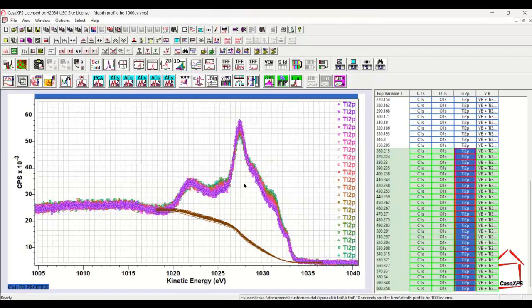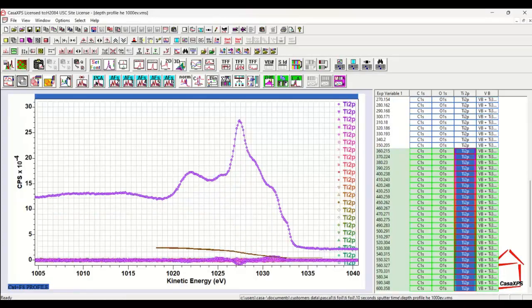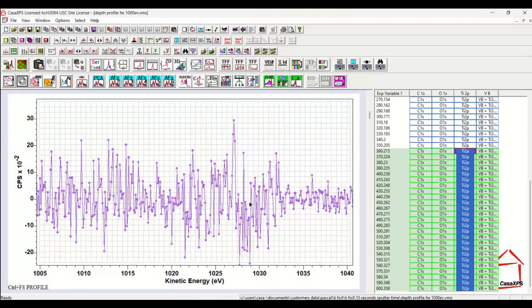To illustrate why you might want to make a selection of this form, I'm just going to do a very quick analysis of these titanium spectra using principal component analysis. The idea of using principal component analysis is to work out the differences between the spectra as we go through a sequence of spectra. Being able to identify spectra that at first sight look very similar in terms of the ratio between oxygen and titanium has meant that I've produced here a set of abstract factors for which the third one, this one here, looks like noise.